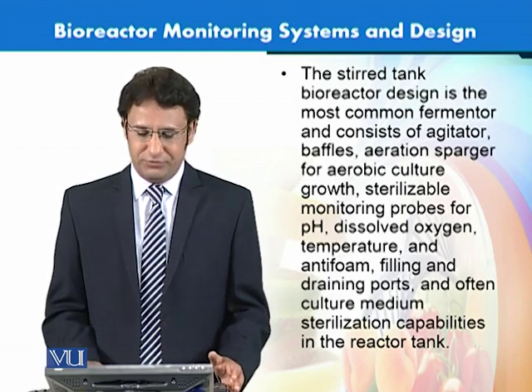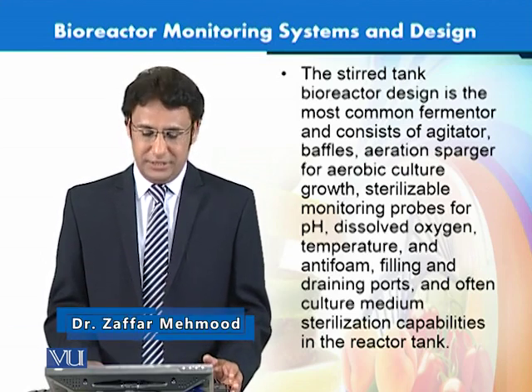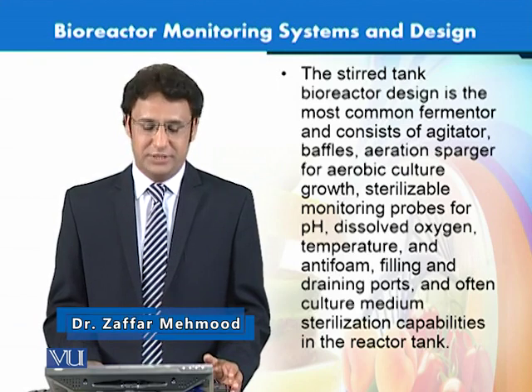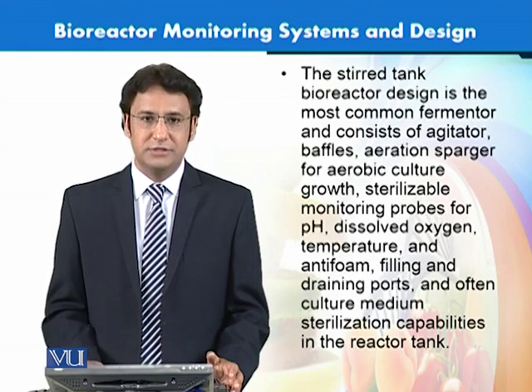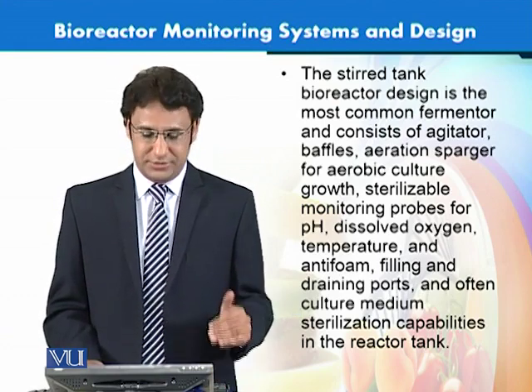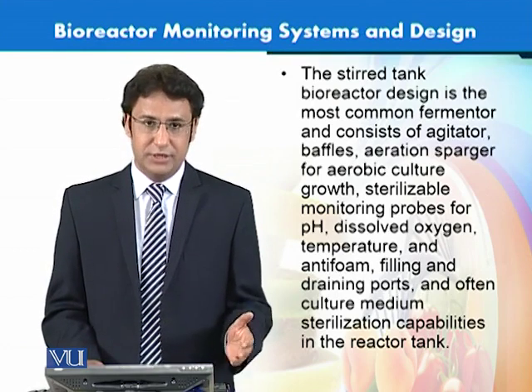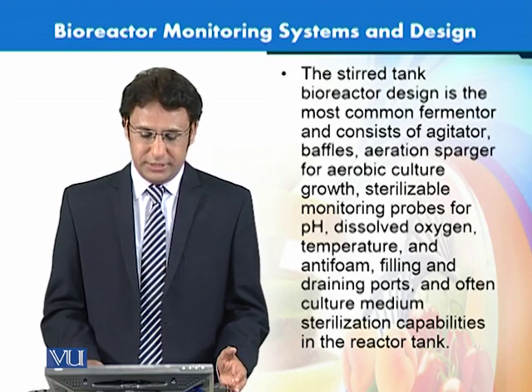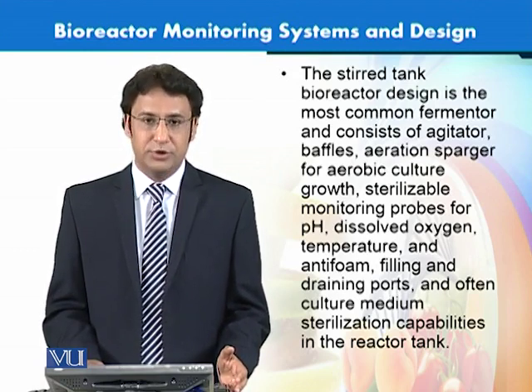If you look at the supporting components within this fermenter, they include an agitator, baffles, and aeration spargers for aerobic culture. It would be producing gases within the substrates to facilitate the growth of microorganisms. Then the sterilizable monitoring probes.